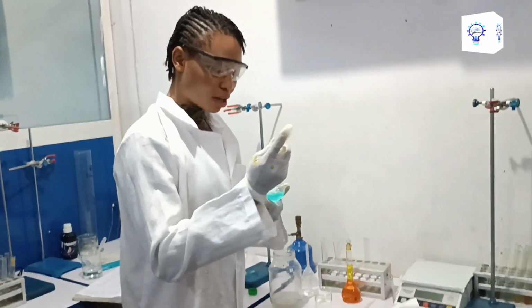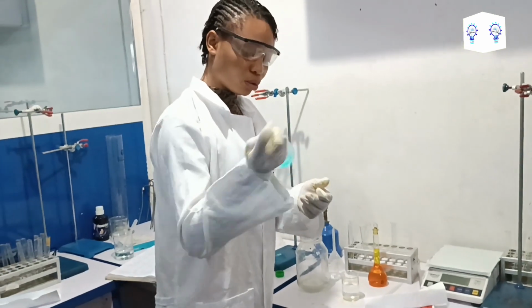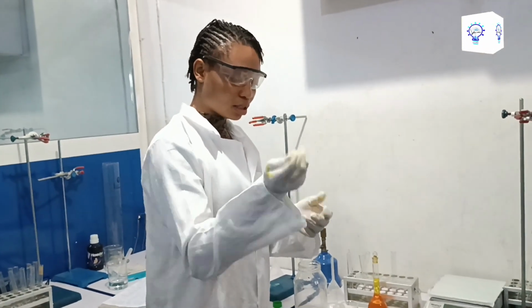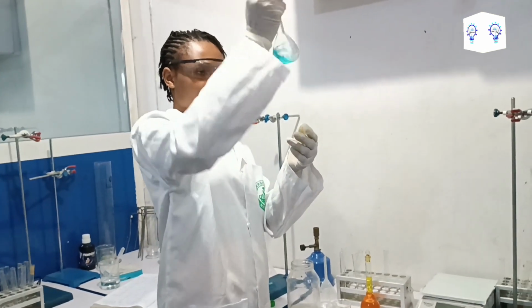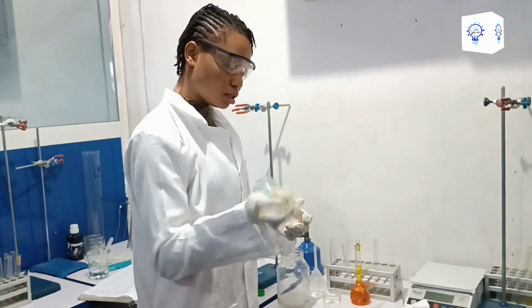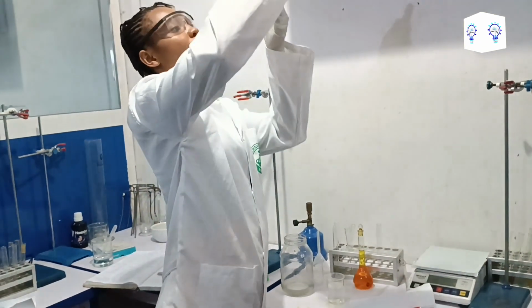See, this volumetric flask is very well covered than the other one. No matter how you cover it, it won't be covered well. Shake until it dissolves before adding more water to make it up.